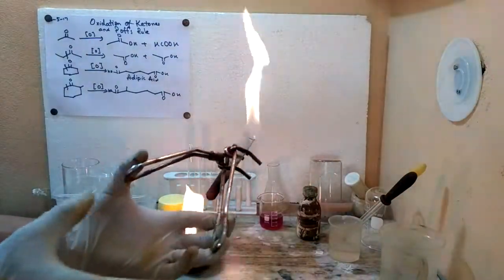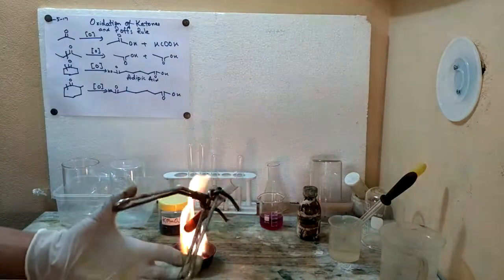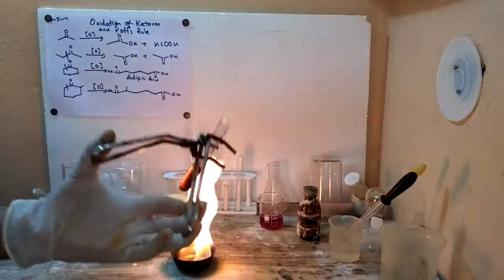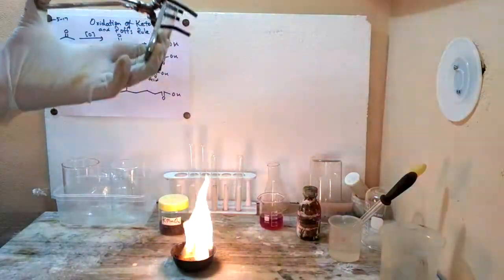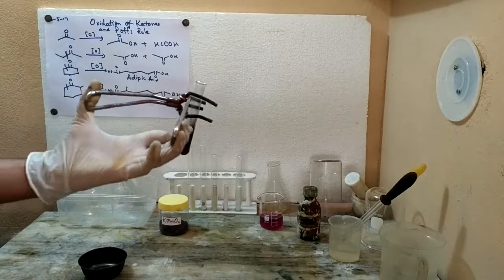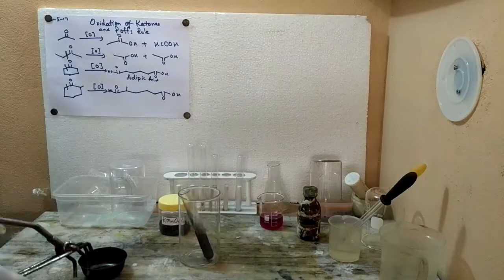Here you need to be careful, because when you are heating a flammable on a flame, there's a chance that the flammable might catch fire. So here is where you need to be careful. I feel the oxidation has completed because the potassium permanganate has decolorized itself. So you can't place it in a plastic test tube holder. You need to place it in glass.